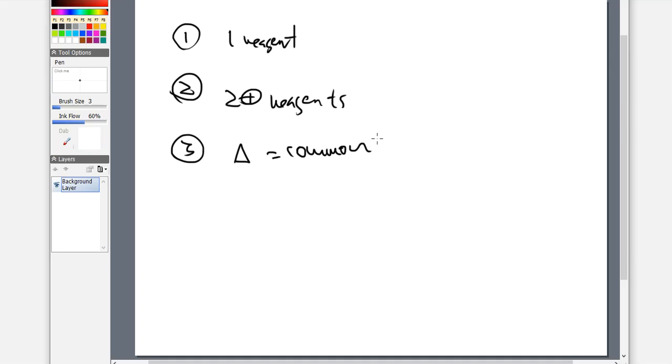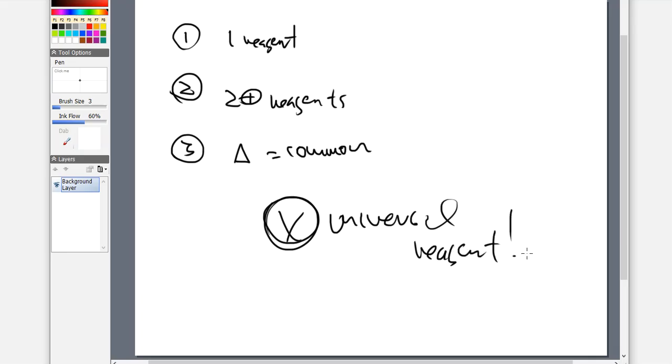I think, though, it is important for me to say that there is not a universal reagent as far as the way the bands and the plates are beginning to develop. There is not, again, a magic bullet. There is nothing that you can use that will take care of everything, that will get everything to turn, everything to visualize better. It's going to be complicated, and it's really going to depend on the types of things that you are putting as the most priority. So what is it that you're looking for? What kind of chemical structure is taking place in those components? And then how can you get those components to show up better?